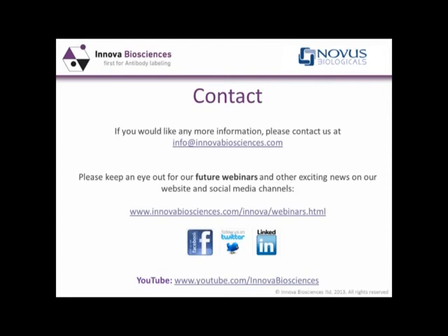You just need to do a little bit of optimization on the amount of pyrophosphatase, because it's quite important that any PPi that's generated by your enzyme is quickly converted into inorganic phosphate. But clearly that's just a question of basic optimization experiments. Remember too, if you need to calculate activity, that you get 2 inorganic phosphates for each pyrophosphate. So the activity will look twice as high as it really is.